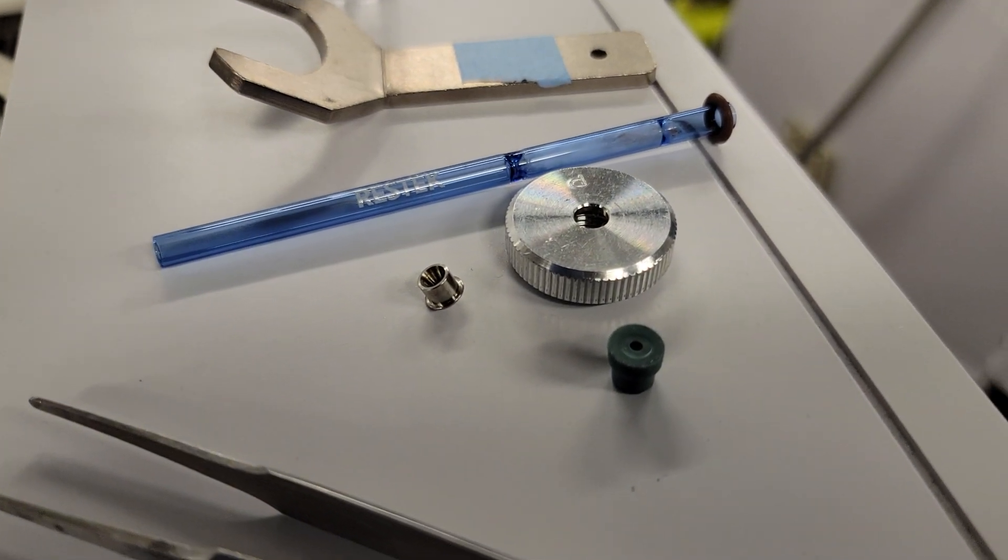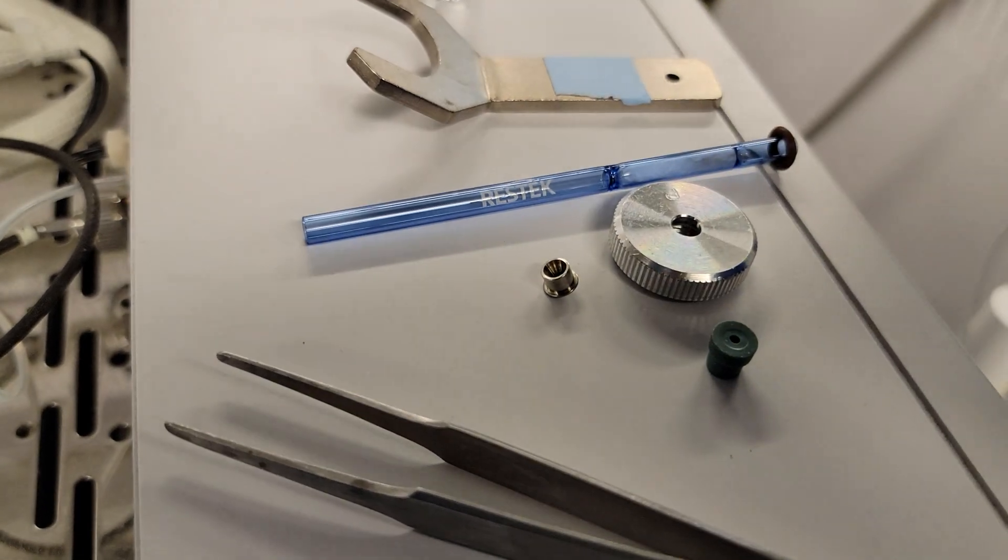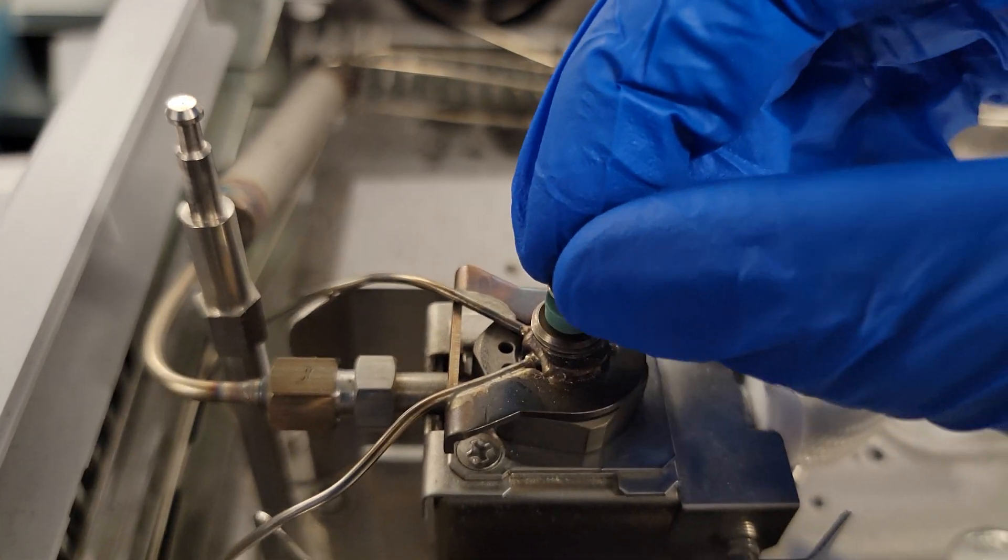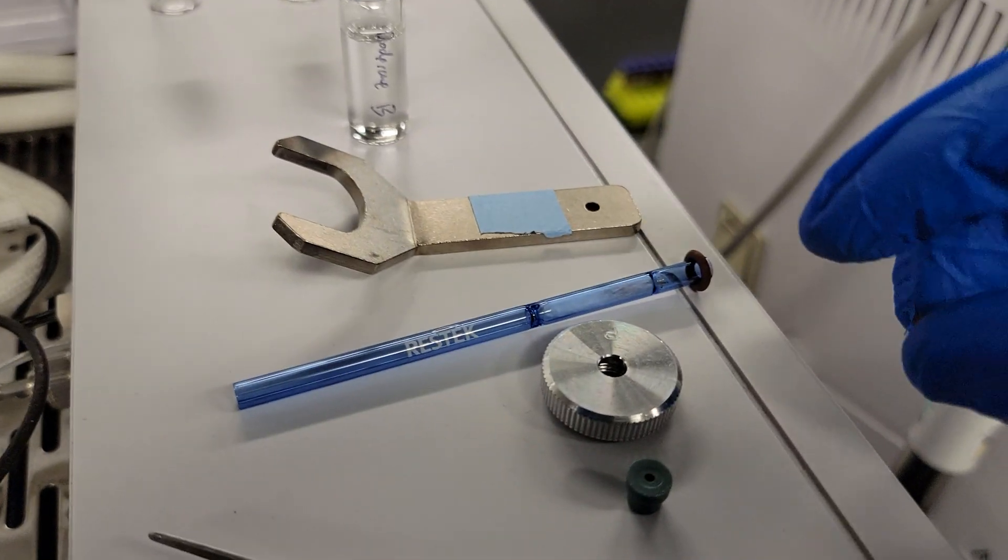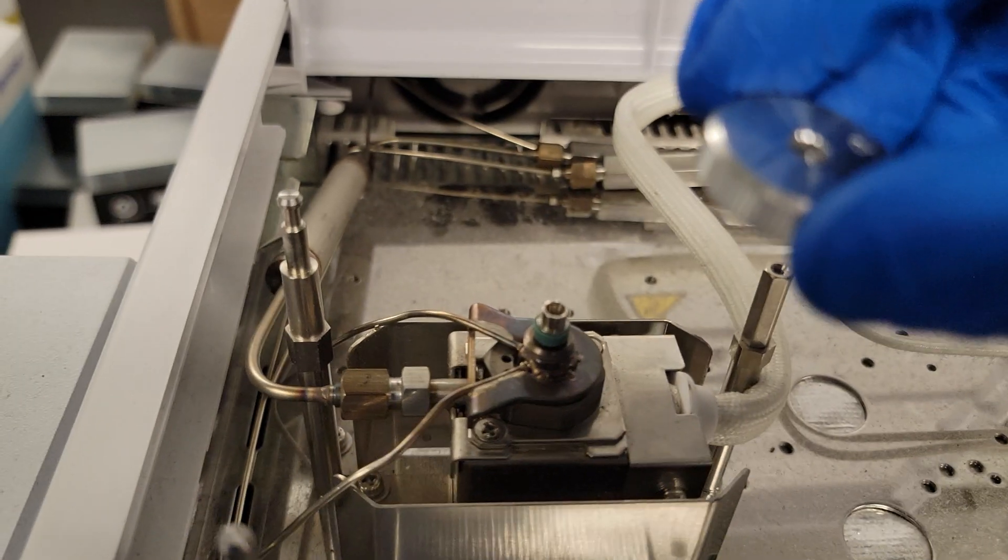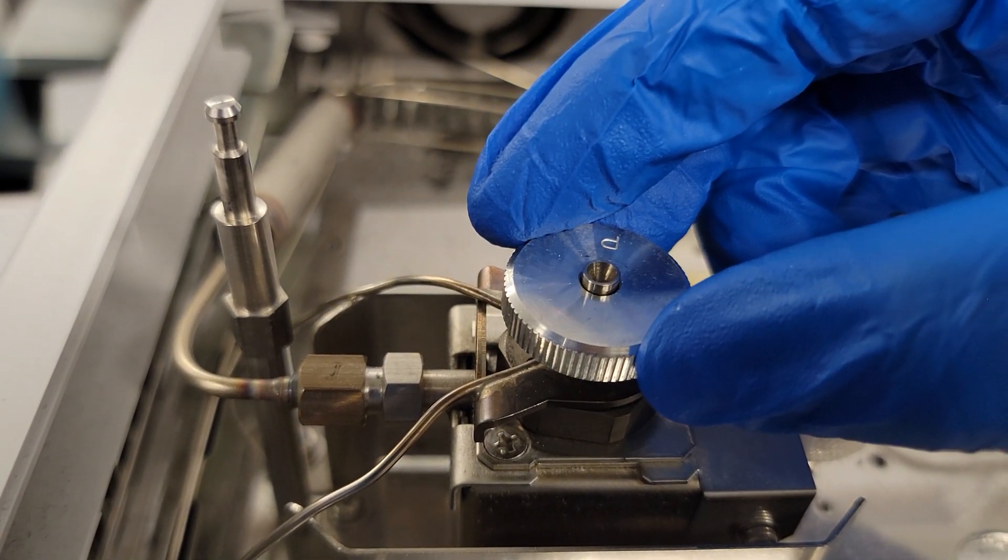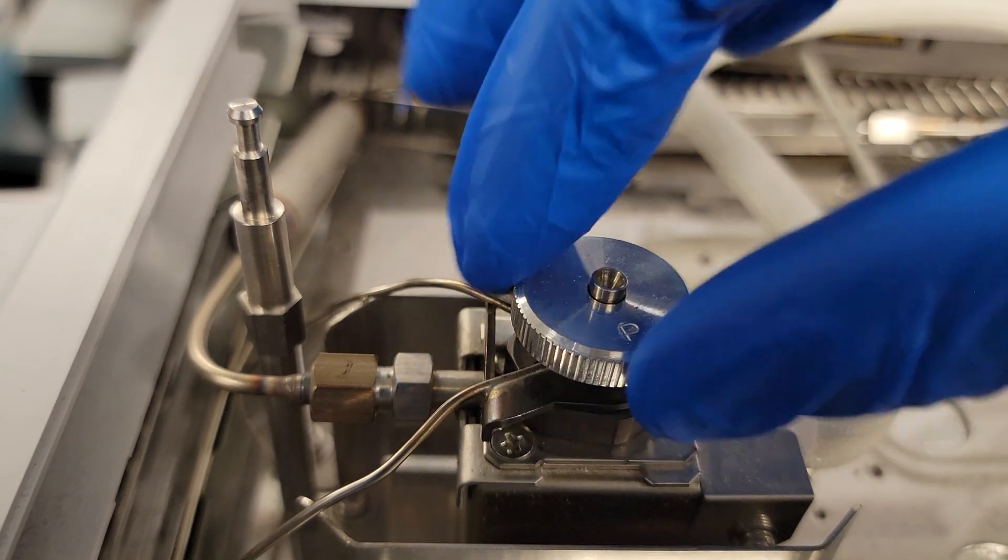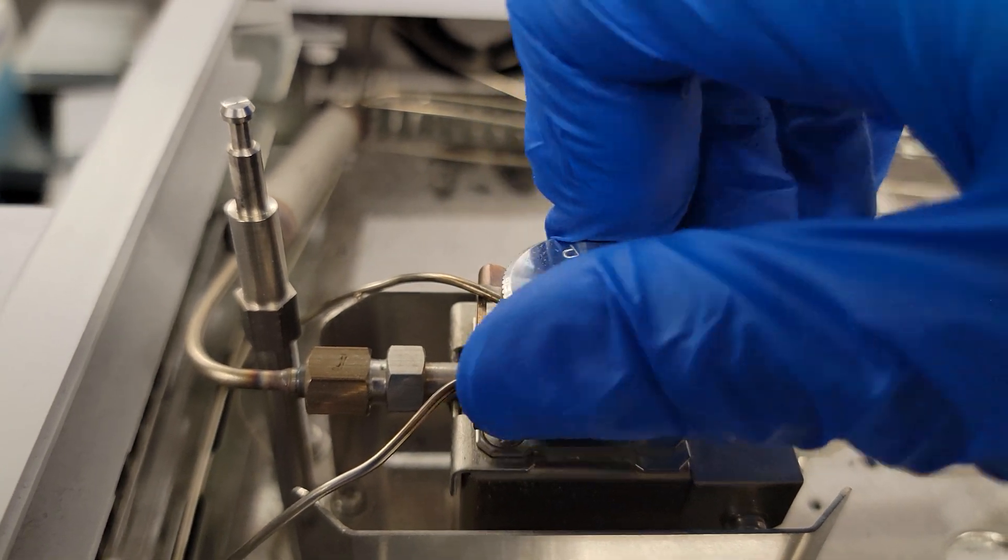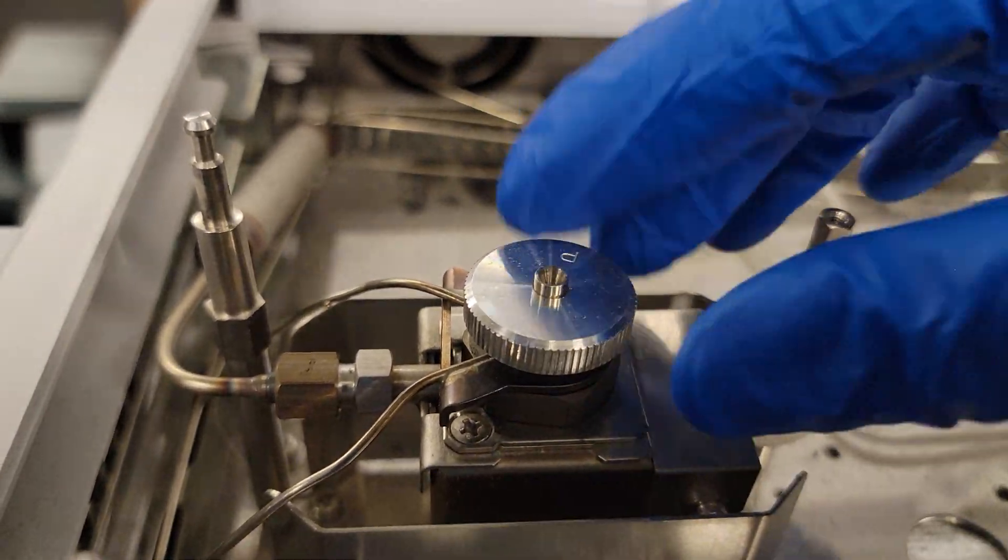These are the parts we had taken out - the old septa and the old insert, old gasket. I left it facing the way I took it out, so I'm just going to take this and gently set it on there so it's centered. Then I'm going to take the nut and carefully put it on top, just like that. That's the only part that I get a little bit scared about. Then just make sure it threads on easily. It sort of stops at the end, so you can't really over-tighten this one.